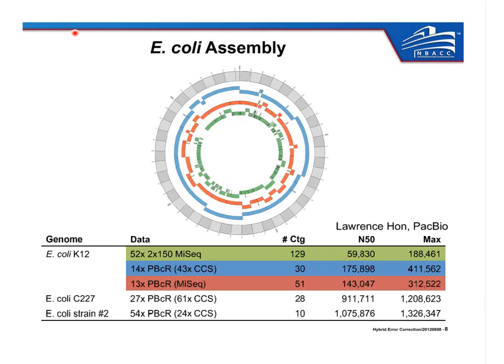Our goal is basically to do this without having to generate any kind of long-range jumping pair libraries, so either Illumina jump libraries that are in the 3,000 to 10,000 base range, or 454 pair libraries which are in the 2,000 plus range, because these are typically very expensive and difficult to construct.